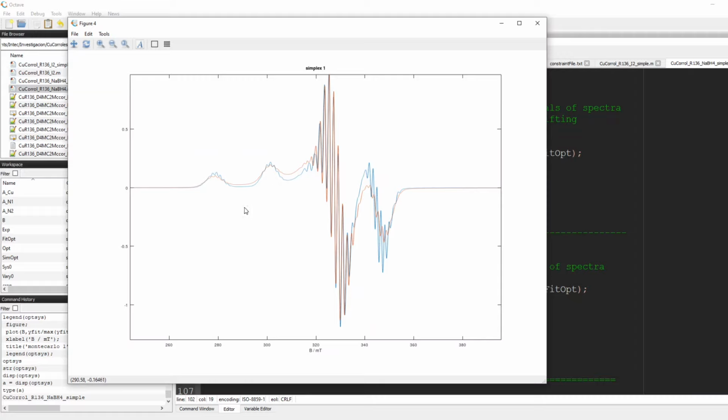There are some differences, but that is to be expected in a complicated spectrum because there are many small approximations that have been done. But what you can see here is first the hyperfine splitting from the copper in the parallel direction. In here you can see this position more or less amounts to the parallel G value of the copper. This amounts to the perpendicular G value of the copper. And you can see here all the super hyperfine splitting from the 4 nitrogen nuclei, plus a little bit of the hyperfine interaction for the copper in the perpendicular direction. So this gives a complicated pattern of lines.